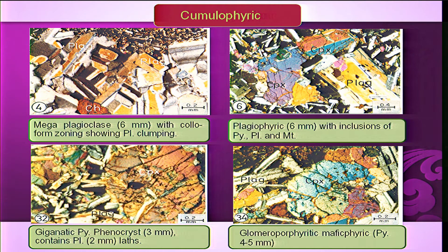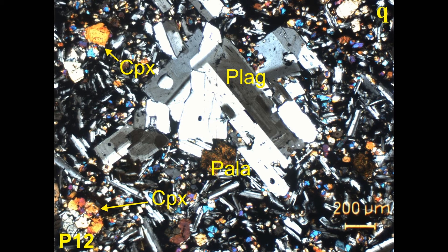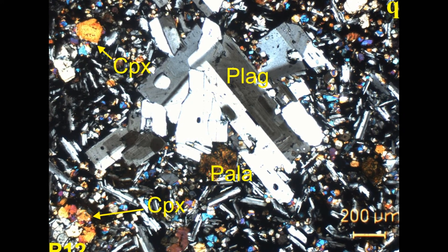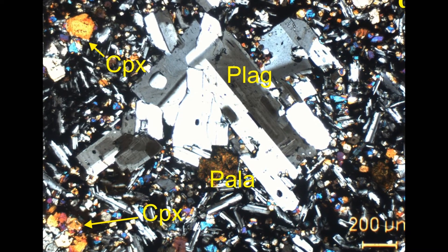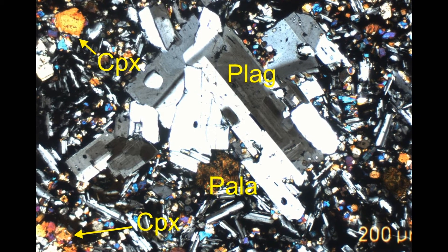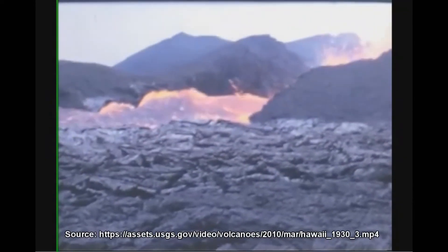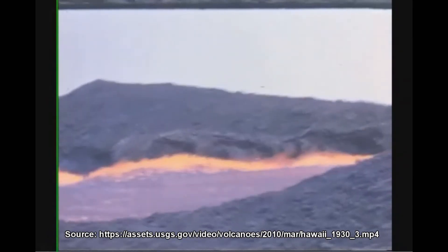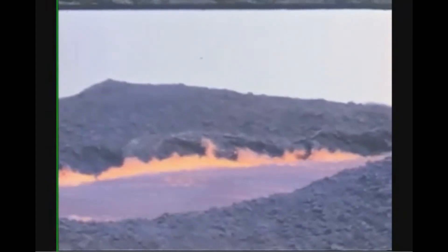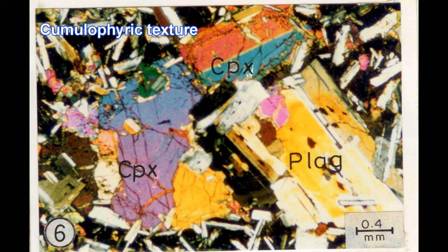Another variety of texture is cumulophyric texture. Each lava flow shows a variety of textures, each with its characteristic textural features — they can be identified and distinguished by these features. Cumulophyric means that many phenocrysts are clumped or clustered together at one place, just like things floating in water during the rainy season that clump together. Similarly, during crystallization in magma, certain crystals club together and form cumulophyric textures.